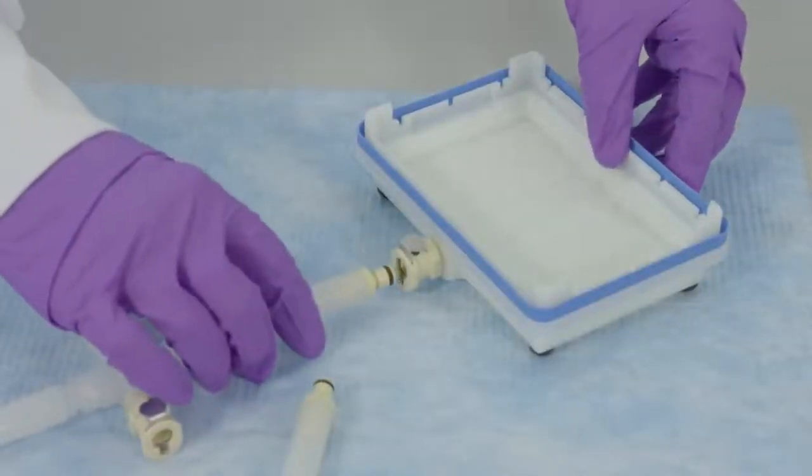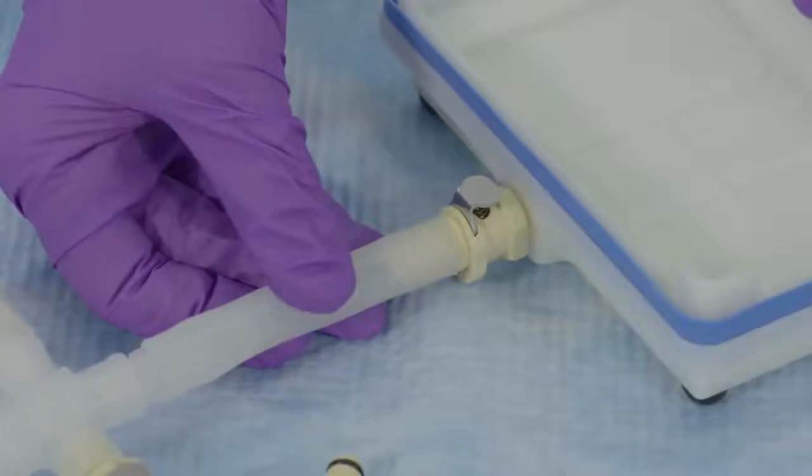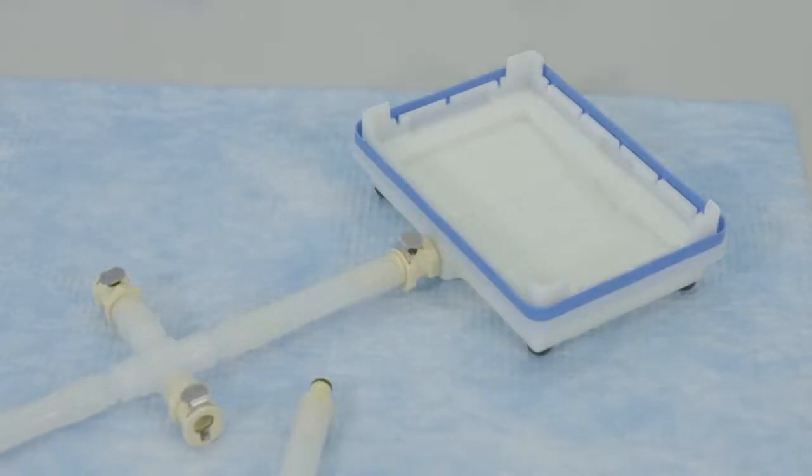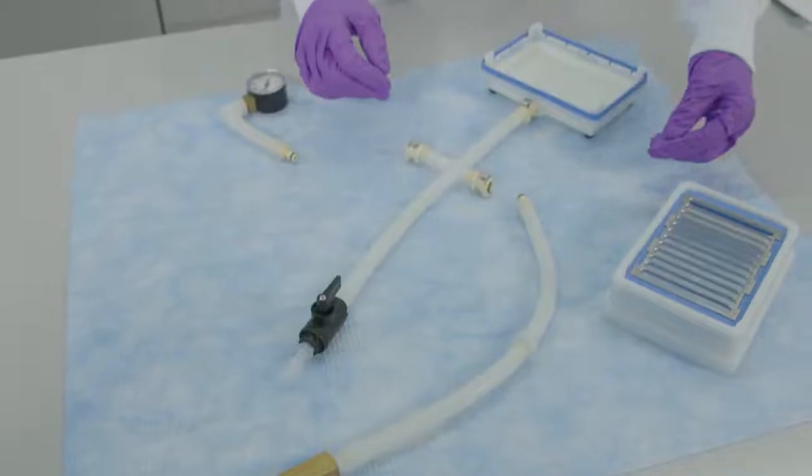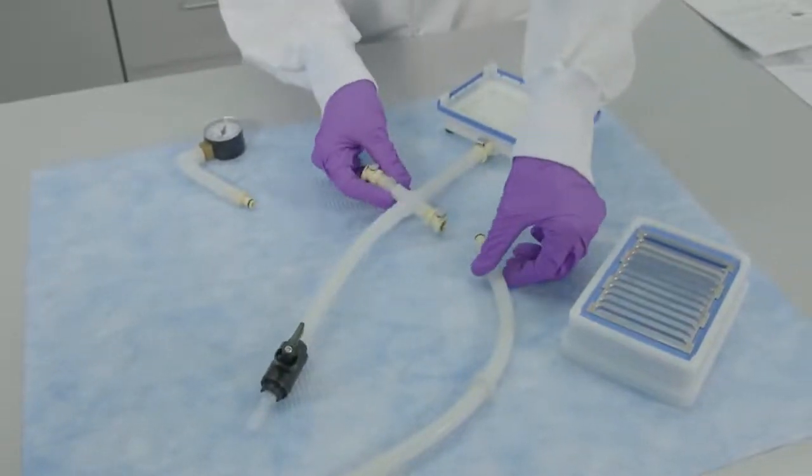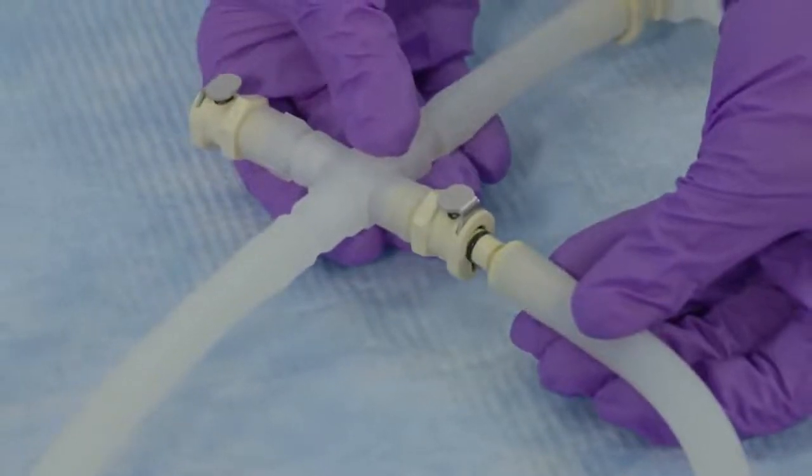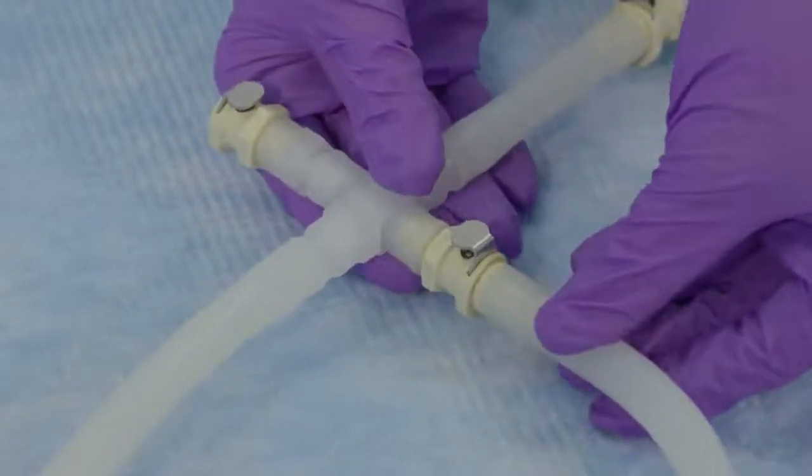Push the coupling insert on the end of the four-way connector into the quick disconnect fitting on the manifold base until it clicks into place. Then push the coupling insert on the end of the vacuum control valve tubing into the quick disconnect fitting on the shorter arm of the four-way connector.